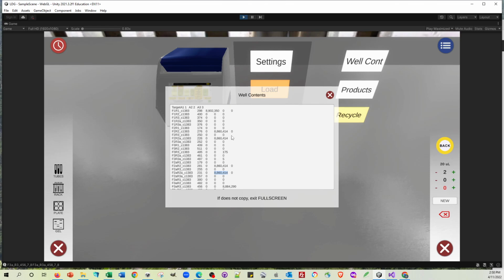And of course, the ability to see exactly what's produced in each tube as a number, so not just as a band on a gel. Of course, these will be put into bands on gels, but the really important thing is that we're able to get a sense of exactly what is being produced. So that's sort of what you can see as a result.